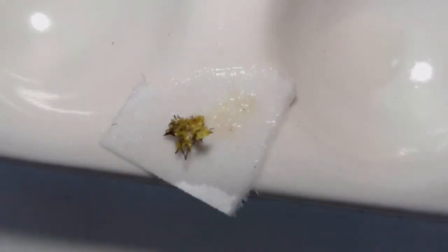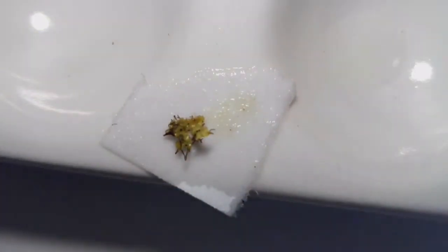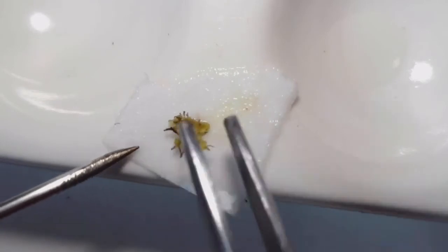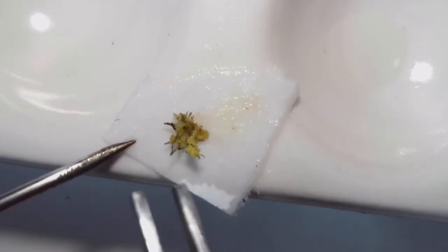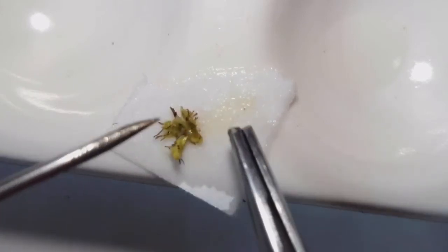I do find that, especially with the K reaction, if you wait too long, essentially it just starts to degrade the lichen because KOH is a base, and so it's basically eating away at the lichen. And so eventually the color will change. I'd say again it's kind of getting more muted now to orange, and that's just because it's starting to break down the lichen.